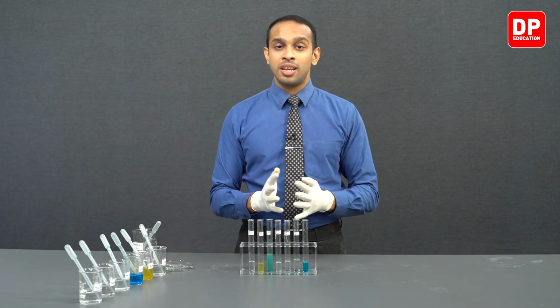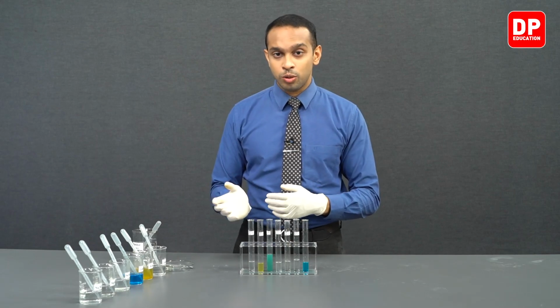When this is taking place, lead metal turns into lead 2 plus ions, while copper 2 plus turns into copper solid. So students, this reaction is what you observed over here.